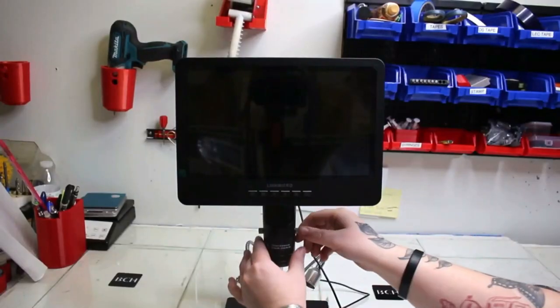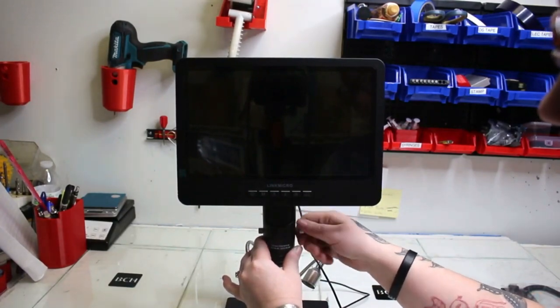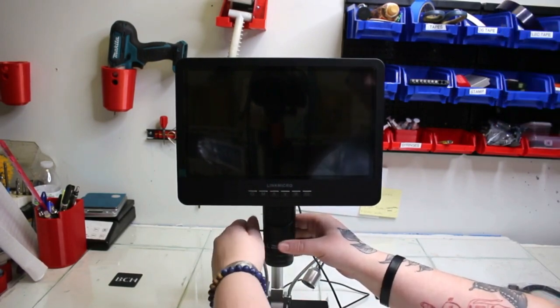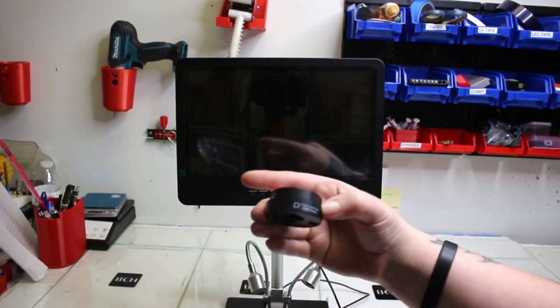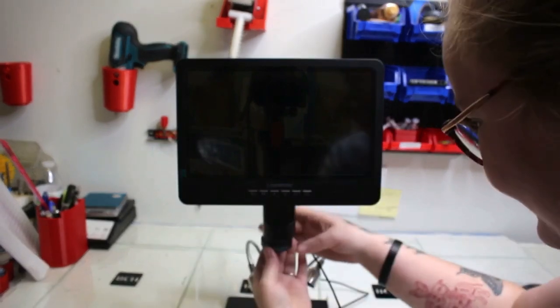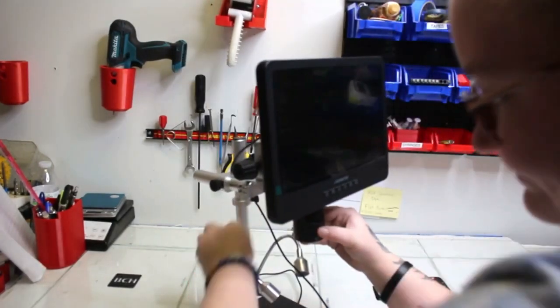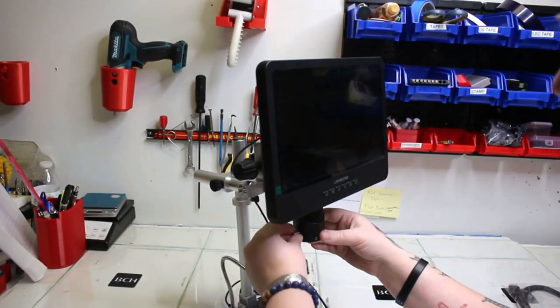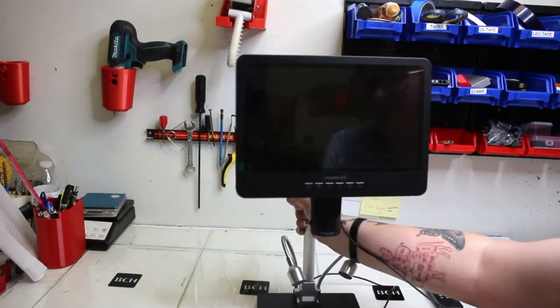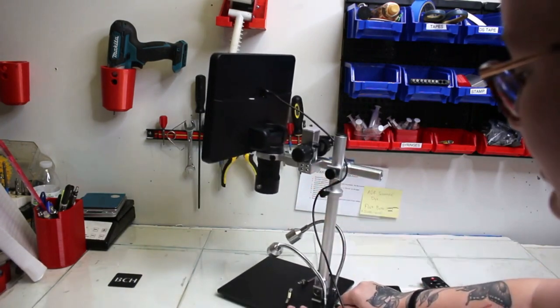That's a bit of viewing lens L and how we would use it. Now I'm going to go ahead and switch out to our last lens, which is lens D. Lens D is used for more of a biology slide — something you might use in science class or for a fun science Sunday with your family. Again being very careful. The box doesn't give room for three lenses, so I assume Link Micro expects you'll always have one lens on the microscope — whatever you take off, put back in the clear bag and into the clear box.